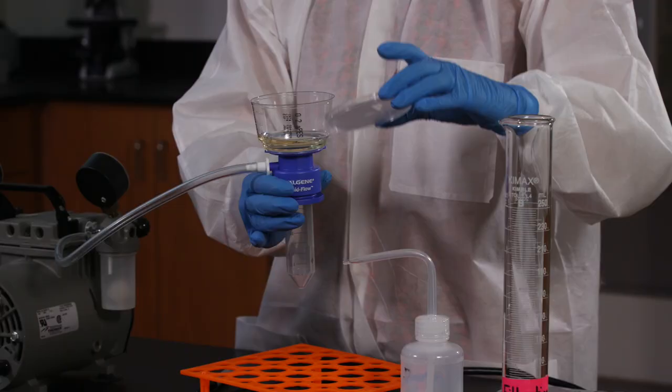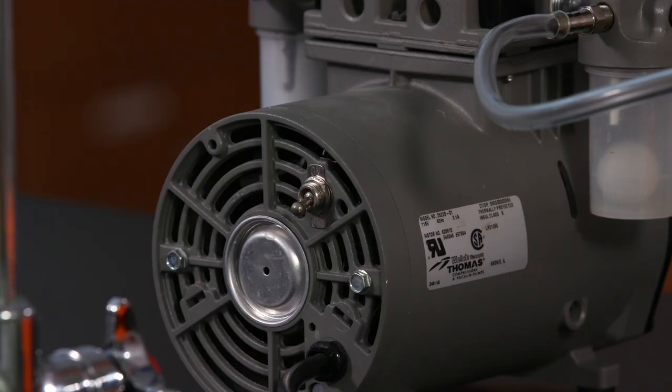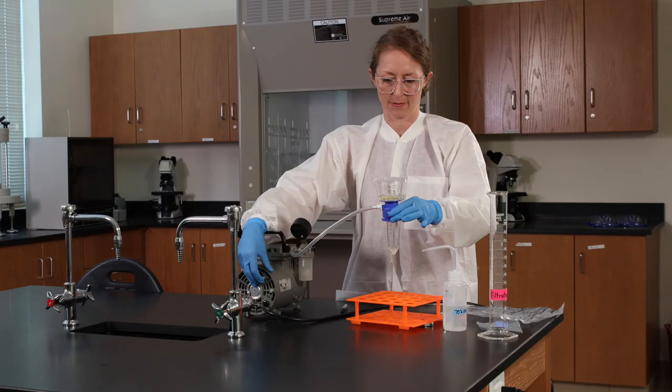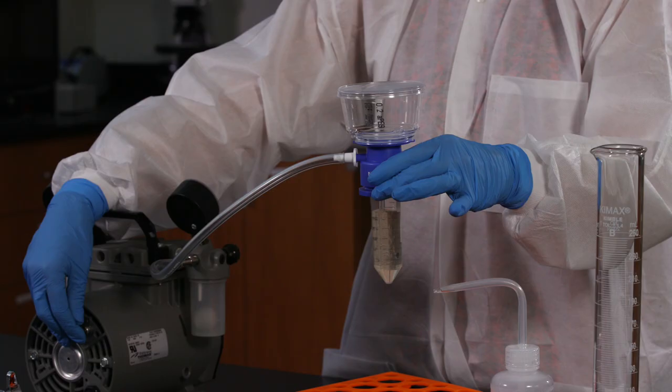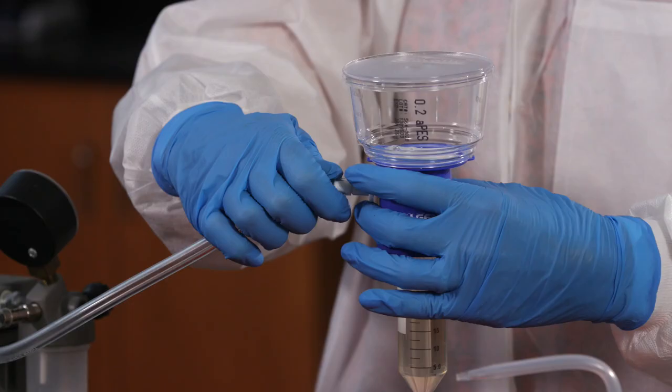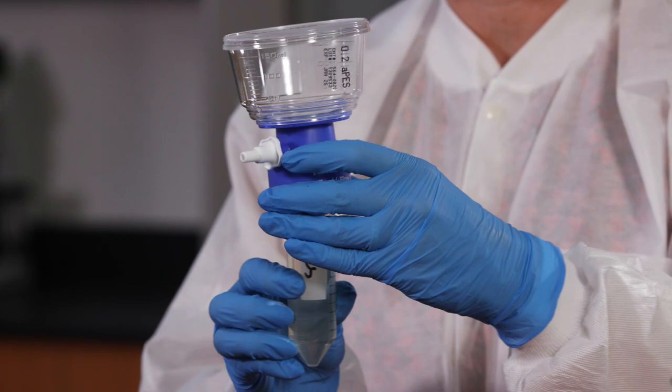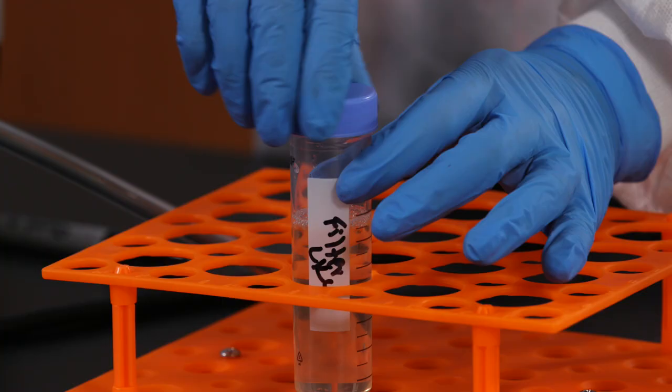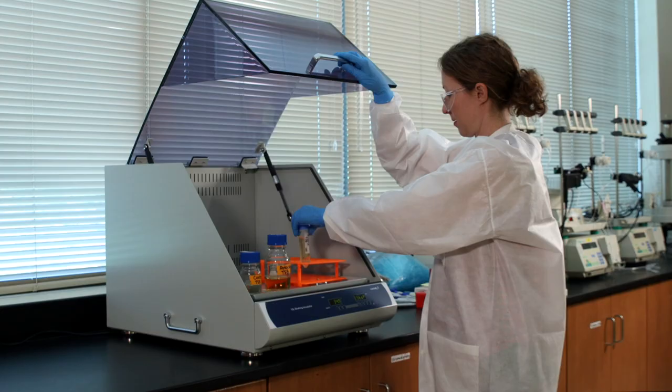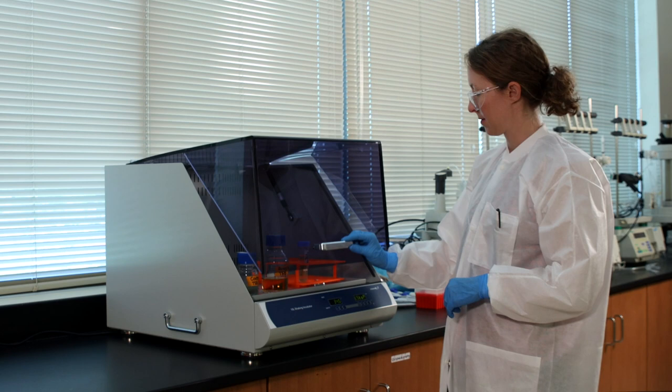Remove the lid, pour the broth into the chamber, then replace the lid. Turn on the pump to start the filtration. Once all the liquid has been filtered, turn off the pump and detach the vacuum line. Label the filtered solution and place it in the incubator with the other two samples.